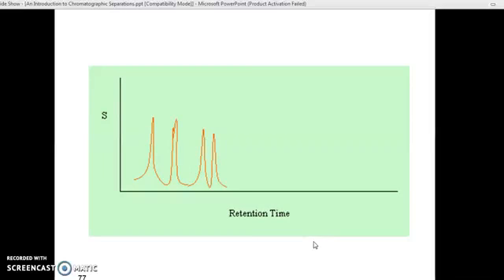Now this is a good peak, whatever you see. In this, the broadening of the peak is high, and it starts immediately, and the result we will see. And the next one has a better resolution compared to this. With this you will see that the broadening is the least and the peak is sharp, as well as the peak area is defined.